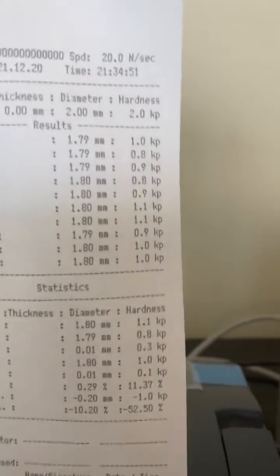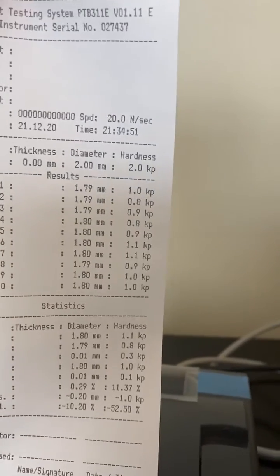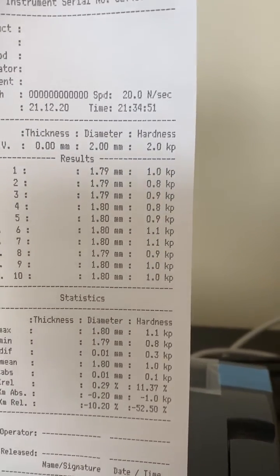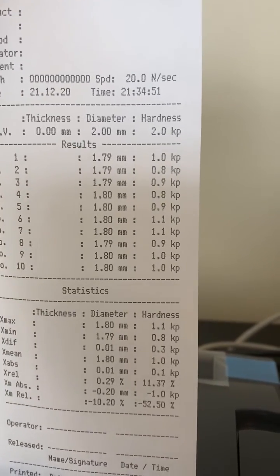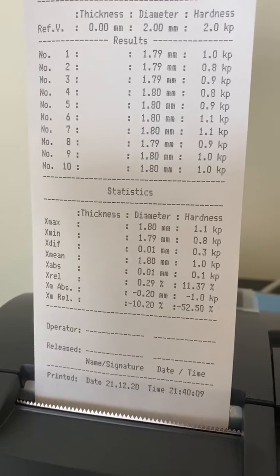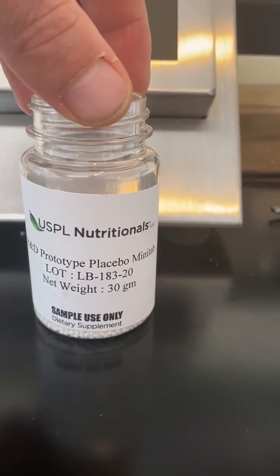I wasn't testing the thickness here — it was just very difficult to turn the tablet one way to get the thickness and then do the diameter and the hardness as well. But you're seeing anywhere from 1.1 to 0.8 kp. The statistics — sign it, date it. That is the lot number LB183200.